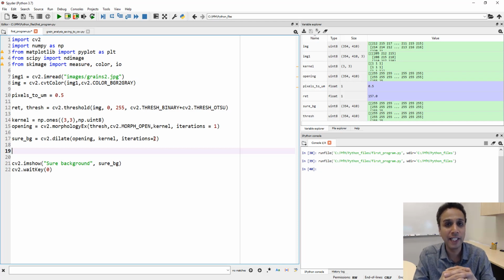In fact, I naively did that as part of my practice run and realized that there are some small grains, and if I erode 4 or 5 times, those grains disappear and I don't have any seeds inside that grain anymore. If I don't do that many operations, then I'm not really sure whether I'm on the grain or on some grain boundary. So we need a different approach. Nothing wrong with doing that, by the way, if your image allows you to be successful doing that operation.